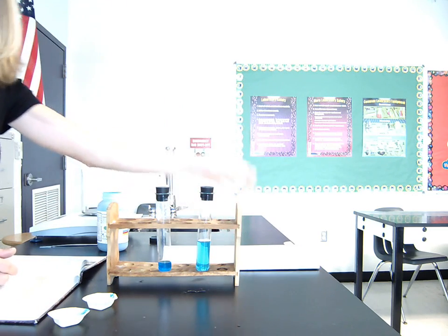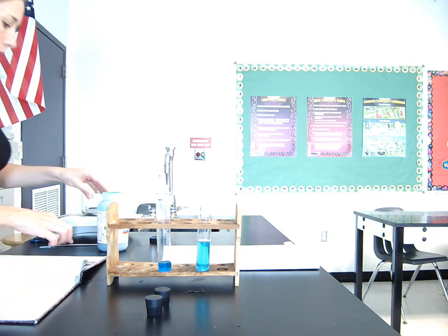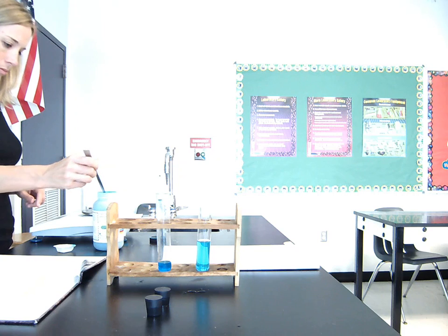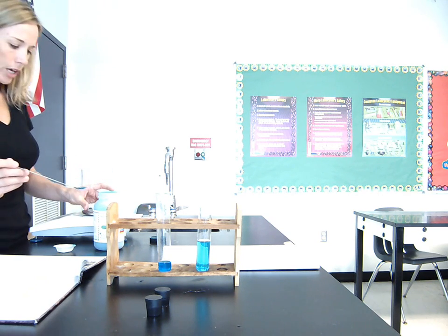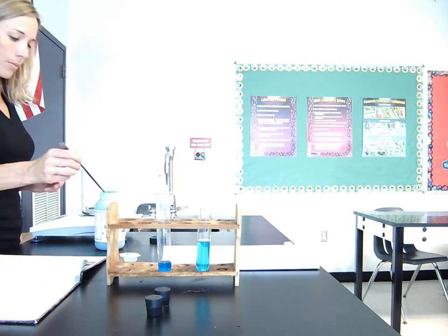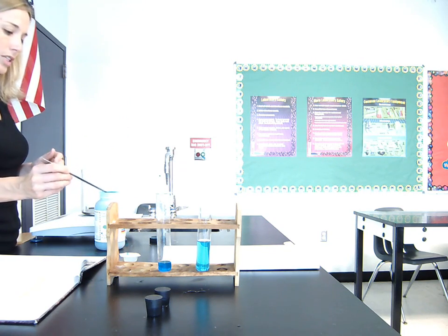Okay, and for a third and final time, we are going to add some more blue stuff. Now, while I'm doing this, it might be worth talking about some of our definitions. I think I mentioned earlier that this is a very vocabulary intensive chapter. Lots of new vocabulary. So it's probably worth noting that what we're doing is creating solutions.